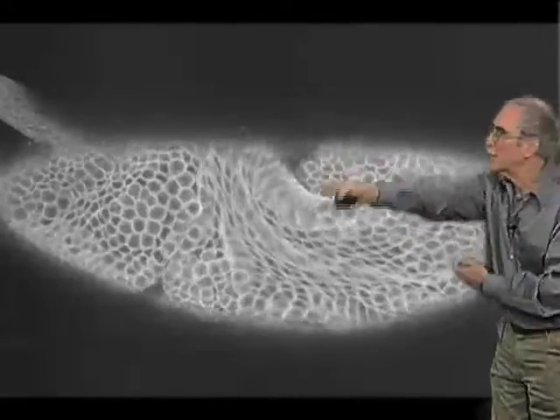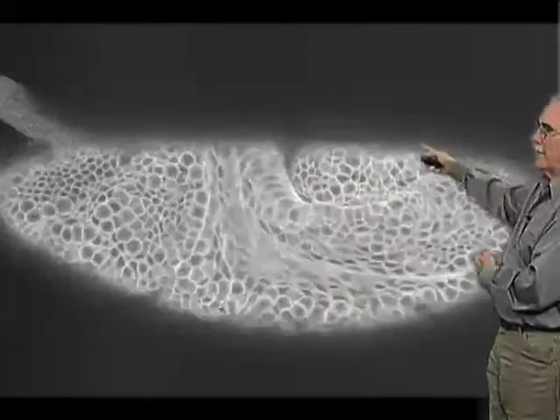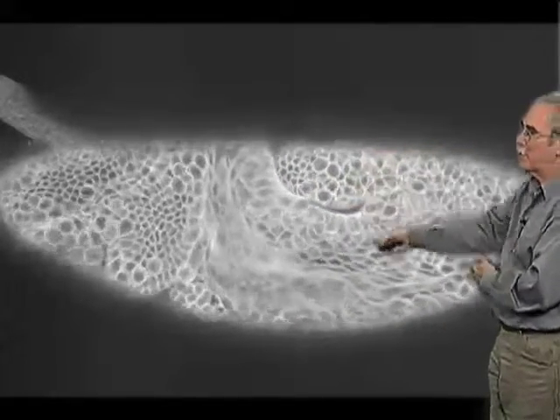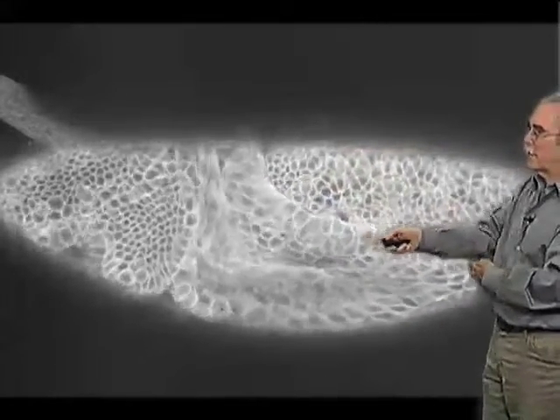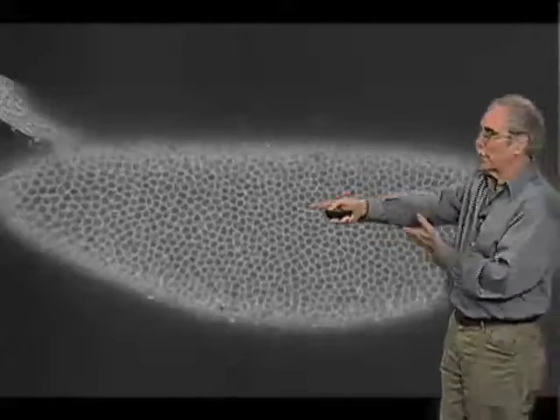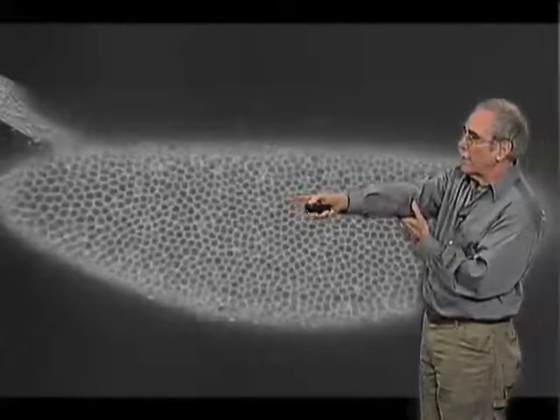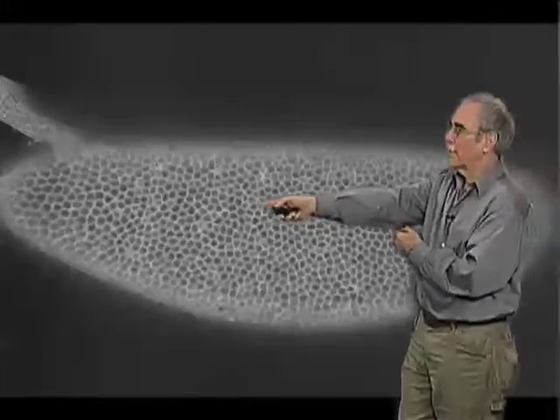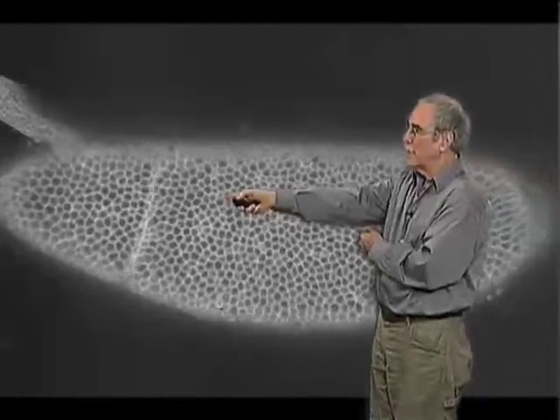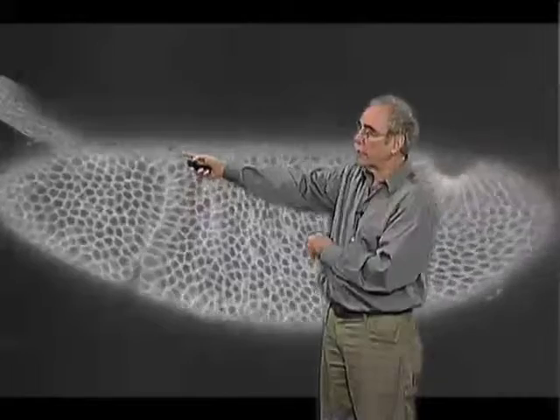You can see this movement of cells — they sweep and move around the end of the embryo. As you watch the process, all the cells start the same, but individual cells begin to become distinct with extraordinary reproducible patterns.